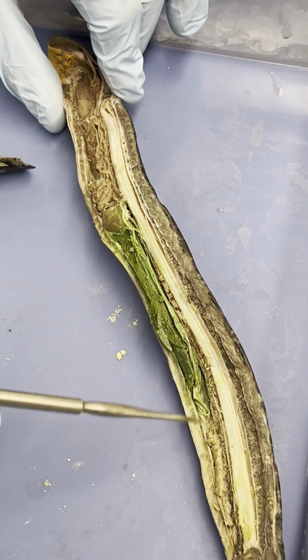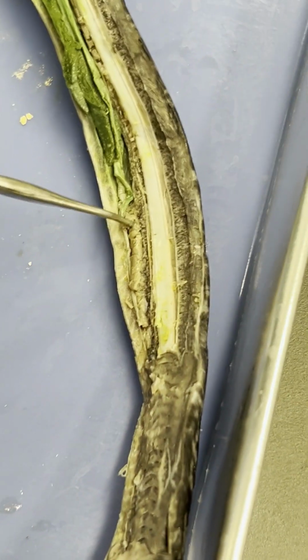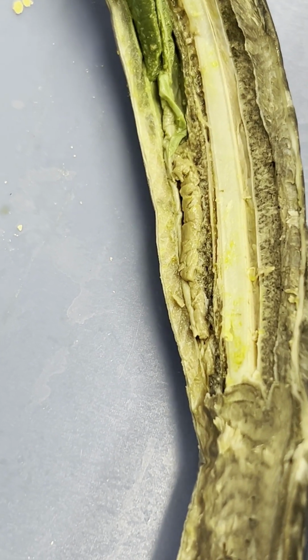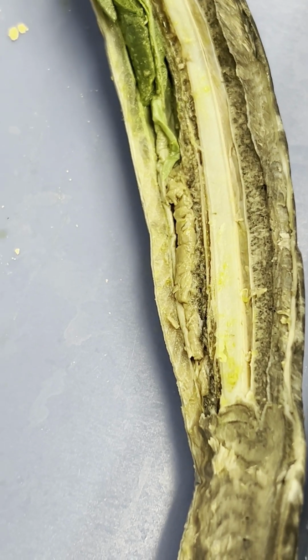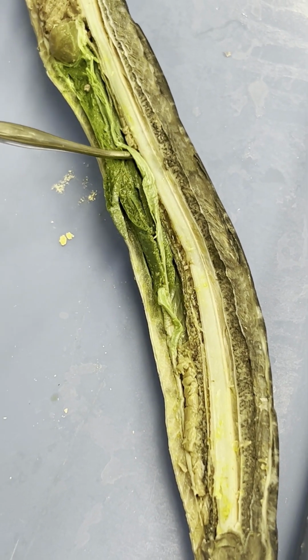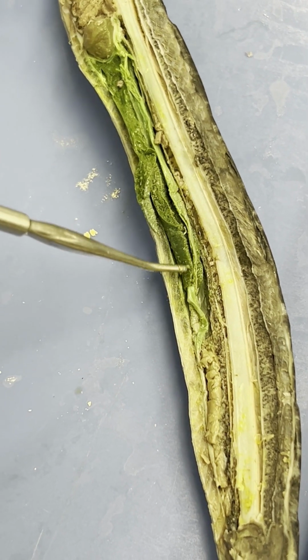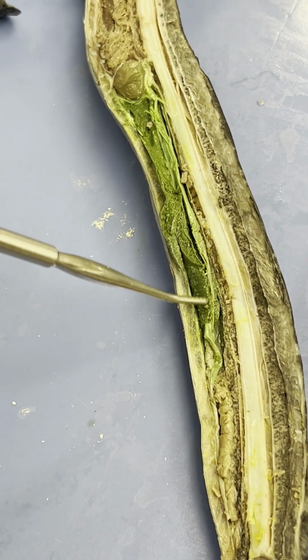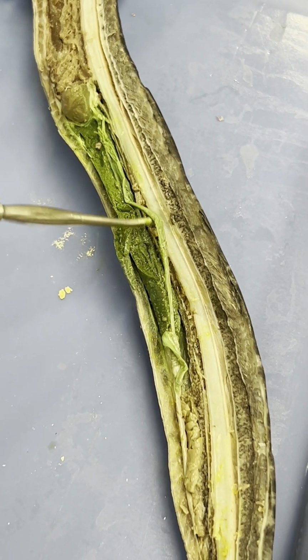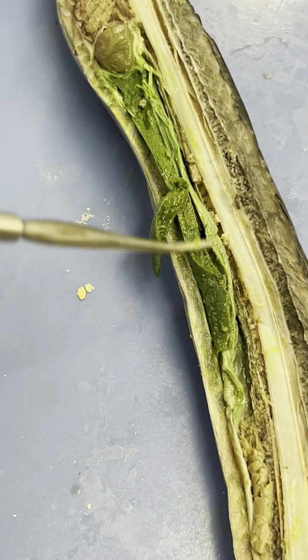Quickly, because we're down in this area, along the intestines we could actually see some of the gonads. So here are some of the gonads of this animal. Hopefully you guys know what gonads are, okay? Also, in my experience, in Dr. Mick's experience, the intestine isn't colored green, but in this case it's colored green because the liver, in our experience, normally is green. So here's actually the liver, with the intestines. Hopefully you guys could see that on the video. Intestine and liver. This whole structure right here is the liver, okay?